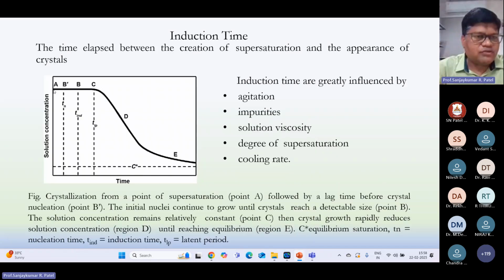Of the solution. So as soon as we start changing parameters, like the temperature, let us do the temperature change. What will happen exactly as soon as we change the temperature at this concentration? Immediately we will not see crystals generated. There is some process occurring in microseconds, or within nanoseconds. So initially we will see that up to here, from point A to point B.